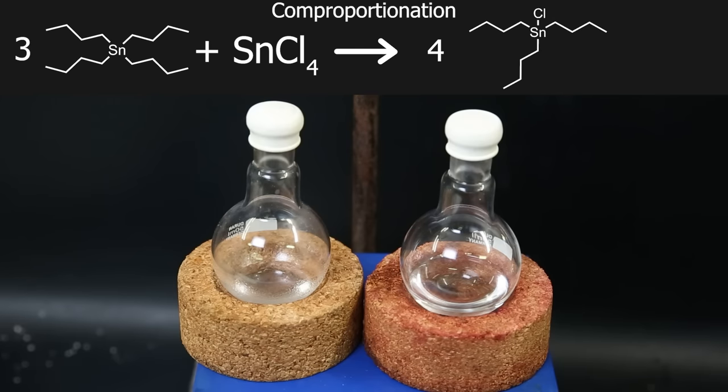In the reaction, the tin chloride and tetrabutyl tin will swap their chloride and butyl groups until they all become balanced. If the mixture contains ¼ tin chloride and ¾ tetrabutyl tin, it will all become tributyl tin chloride.